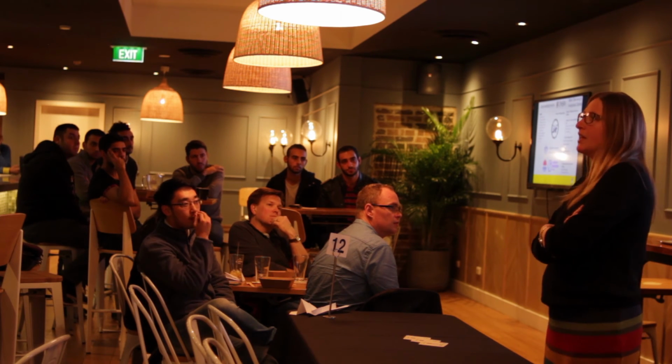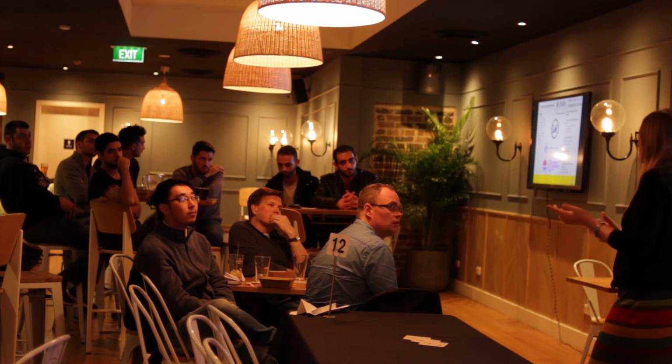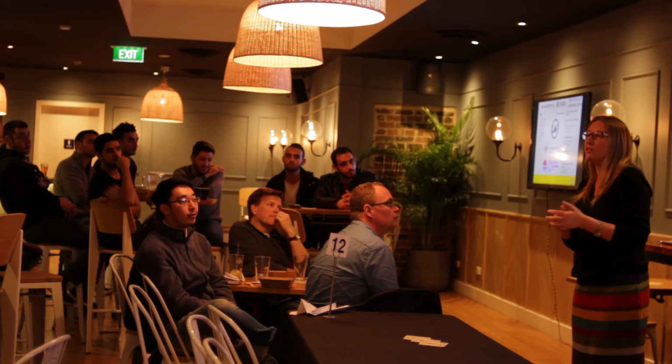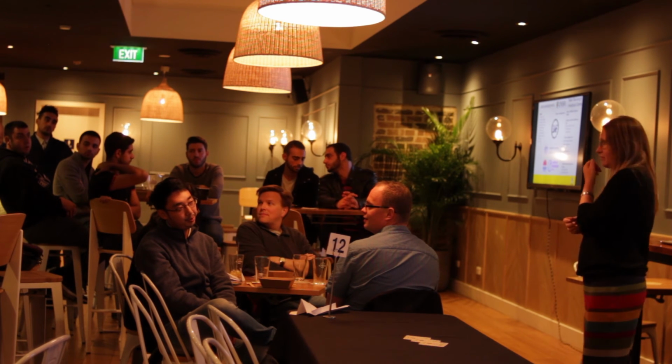What we're testing now, and what people are working on around the world, is making sure that they don't change those numbers, because in the end, this is for quantification. It's for us to find out what percentage of my drug ended up in the nucleus. The thing about that, though, is that even if you compress it, it doesn't really help you visualize it, because it's got to be uncompressed to actually see it. So all it would ever do is help you storage-wise.